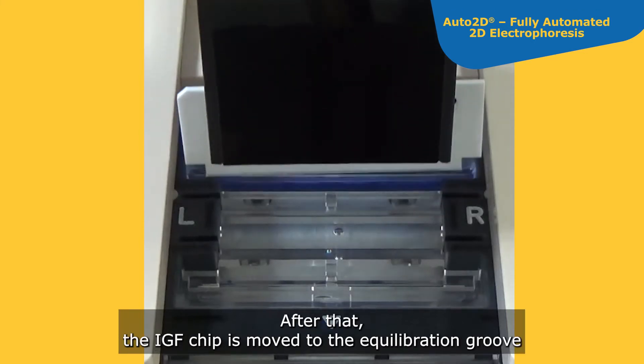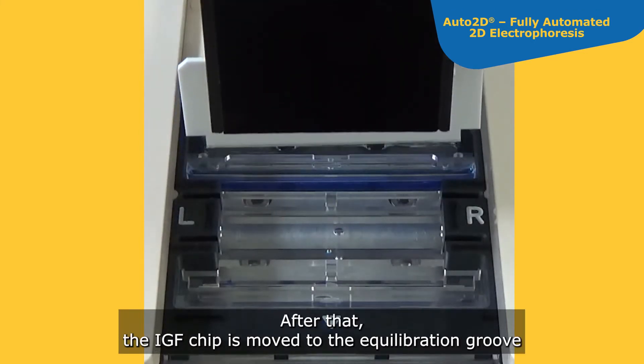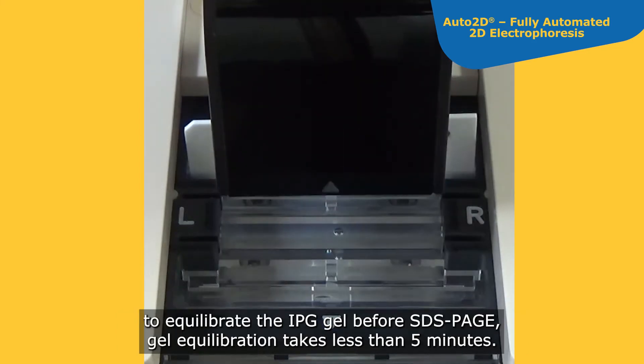After that, the IEF chip is moved to the equilibration groove to equilibrate the IPG gel before SDS-PAGE. Gel equilibration takes less than 5 minutes.